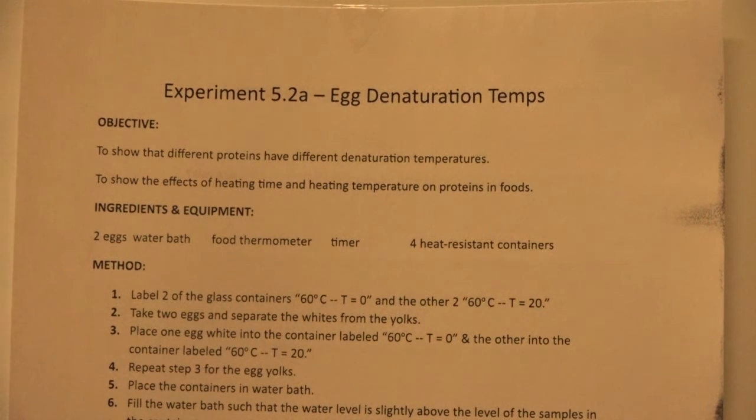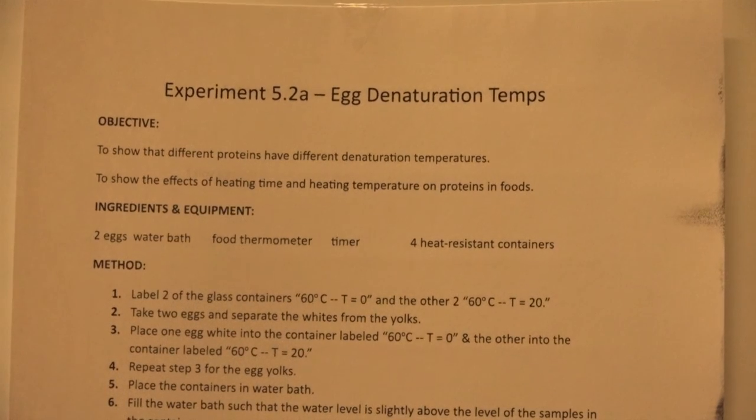We're going to be making some modifications to this lab just for the sake of videoing and of manpower and things like that. That's going to make it a little bit difficult to follow this lab as we would do it in the classroom, where we would have various lab groups doing different things. So here is our ingredients and equipment for this lab.